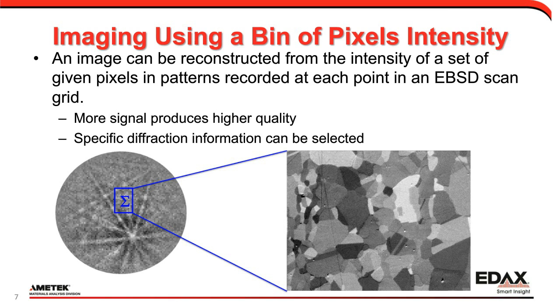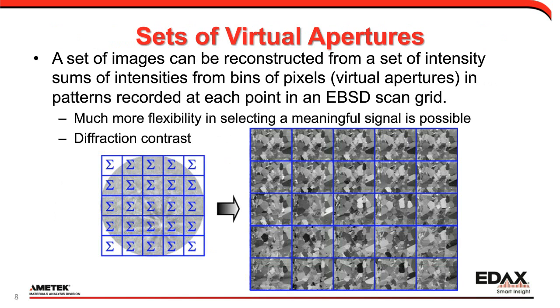There are a number of location options available, like 3x3 adjustable, 5x5 fixed, 3 fixed, and multiple user-defined. This slide shows the location option for a 5x5 fixed grid of potential virtual apertures. The display shows the location of the virtual apertures on the screen and the resultant dark field image for each virtual aperture.